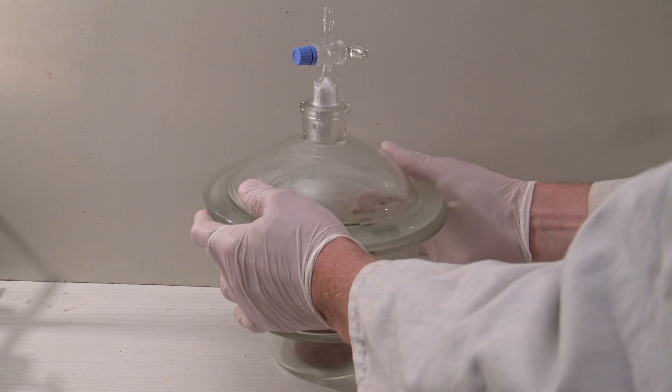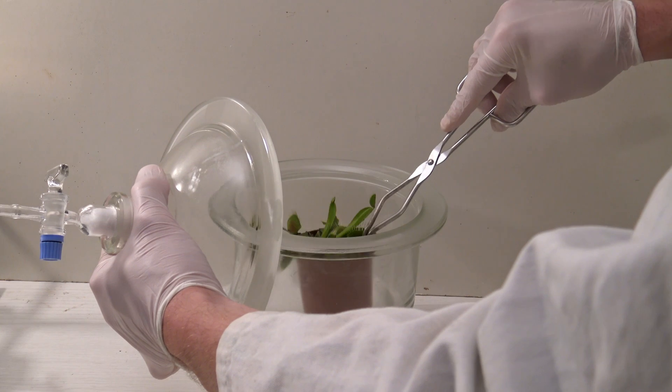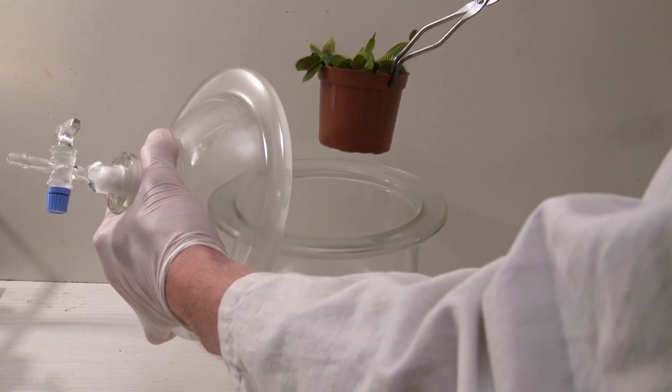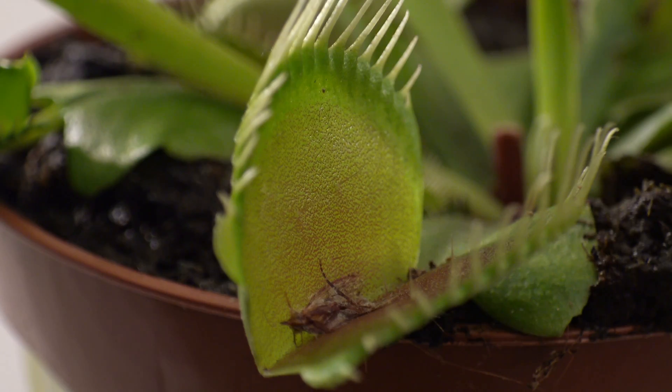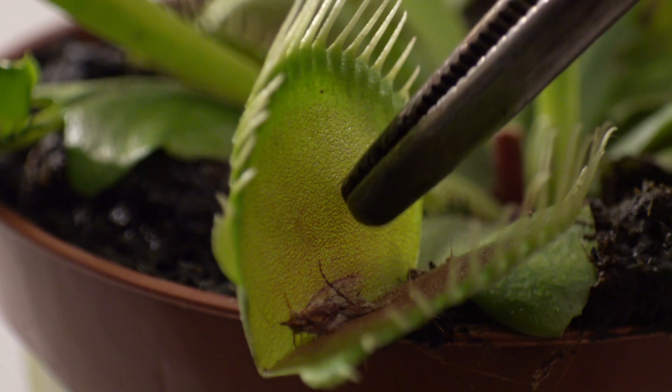Next, the plant was removed with crucible thongs so the amount of escaping vapors, which are heavier than air, was as low as possible. When the trigger hairs in the first leaf were touched, no reaction took place, which usually happens after touching them two times.